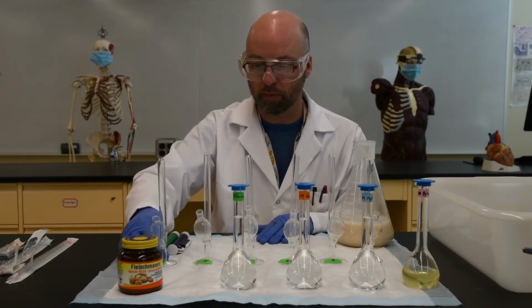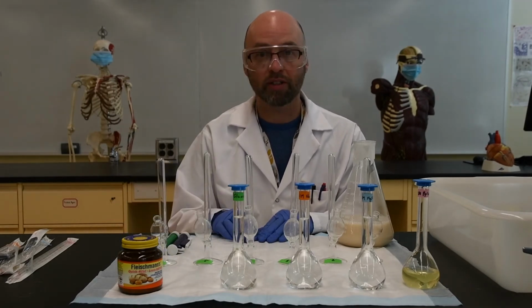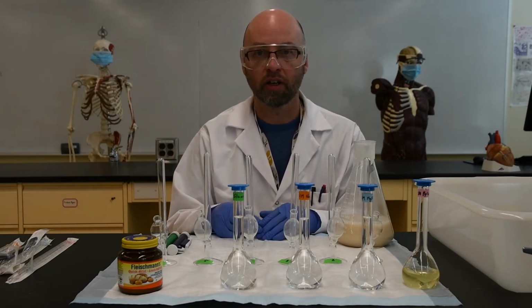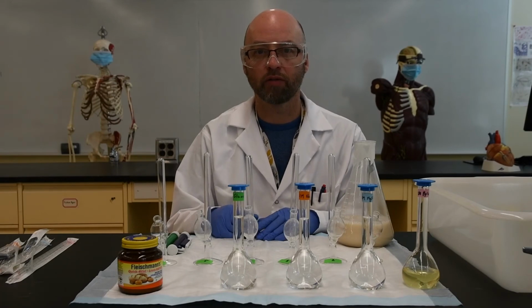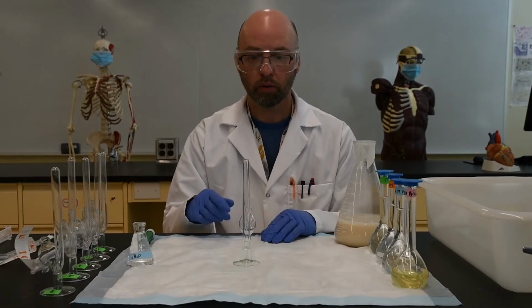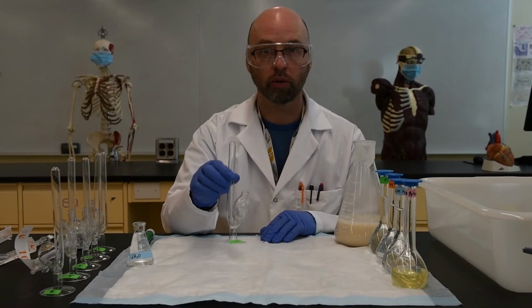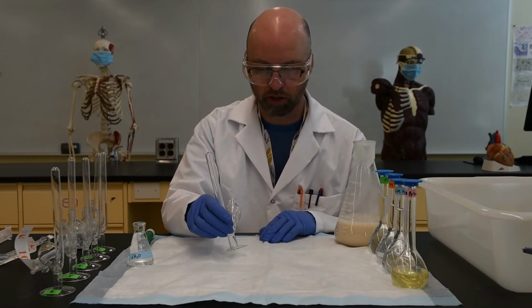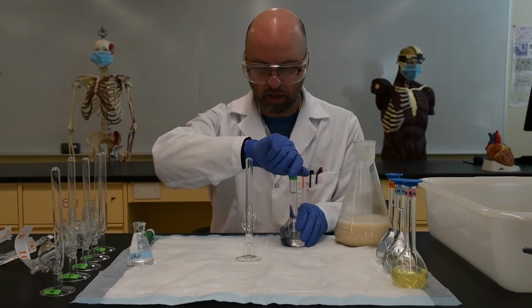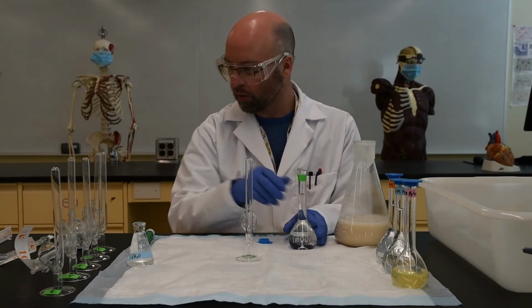So in a second I'm going to show you how the tubes are filled, and then we'll fast forward through all the filling so you don't have to sit through it, it's a bit tedious, and then I'll show you the experiment and measurements. Okay, so let's just show you how to fill one of these. So I'm just going to do tube number 1 for now. This one's going to contain 2.5 ml of this glucose.